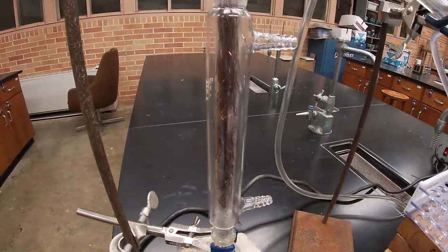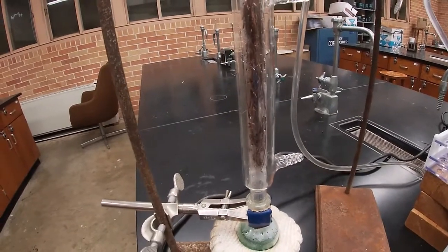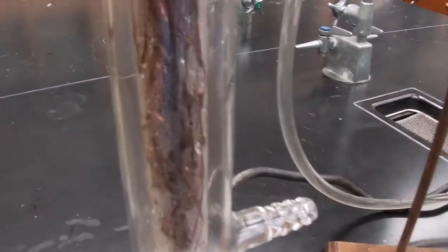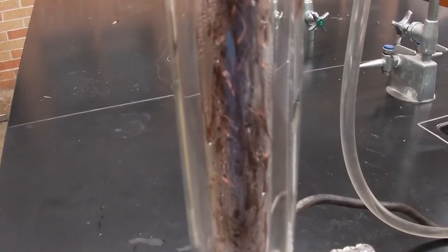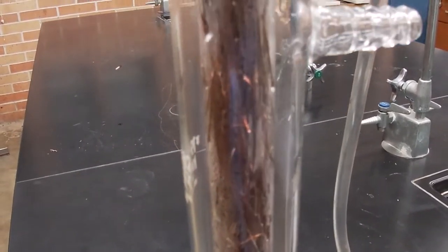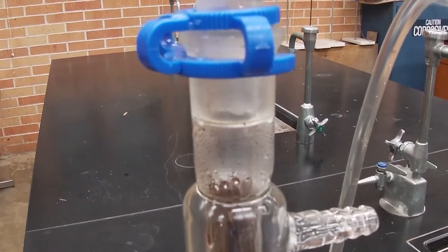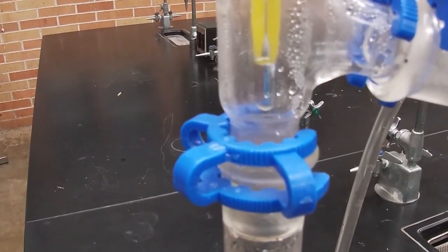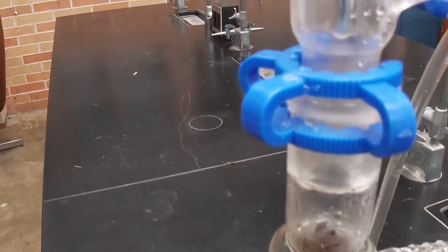I don't know how well that's coming out on the camera. But what's going on is we're getting a series of little micro distillations inside that fractionating column, repeated over and over. And by the time they get to the top, your methanol, the lower boiling component, is going to come off first. And so the vapors are just now getting up here. You see right there? Hadn't made it to the thermometer yet.